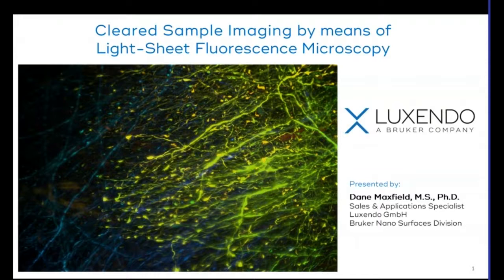What's the max sample size you can have for a double-sided illumination? I think you mean double-sided detection, and that would be 8 millimeters wide on the small axis. For big samples, how do you reduce shadowing and stripes? The way that we go about doing this is rotating the sample slightly. So we can rotate and take this from multiple views and then fuse this together to create a high resolution image.